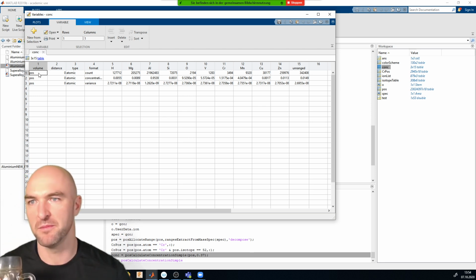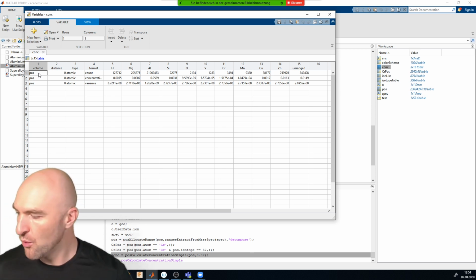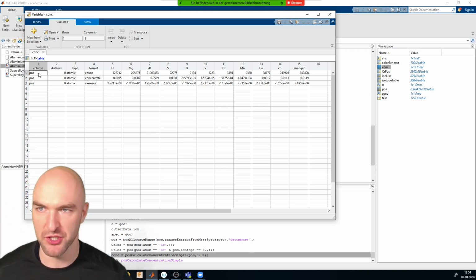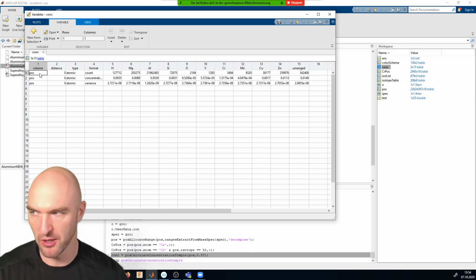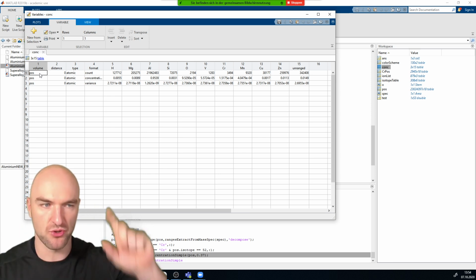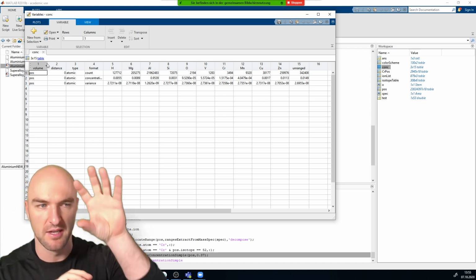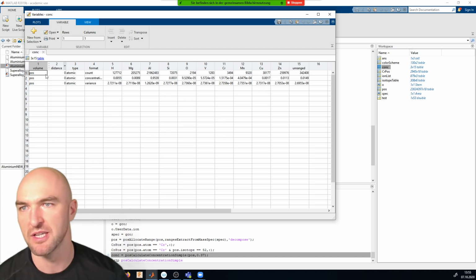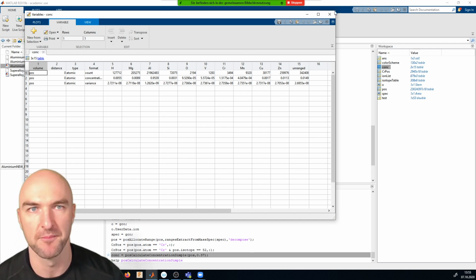And why the volume is important will come up later, because once we plot the concentration, we can have multiple volumes that we plot into the same plot, and it will just compare the concentrations of the different volumes. So say you have 2 different data sets and you want to compare the concentrations that you have calculated, or you have 2 different regions of interest, then you can do that by giving the volume the appropriate name.